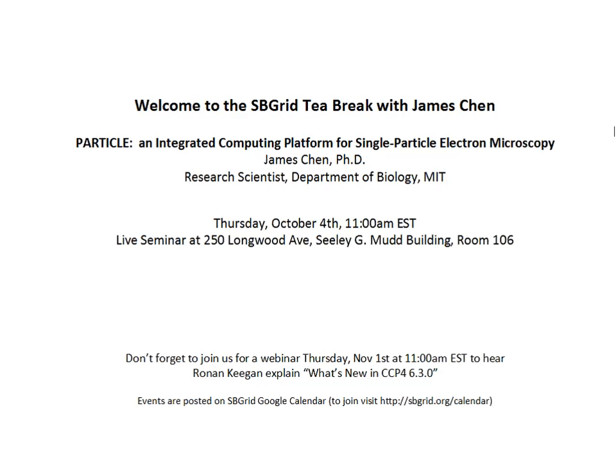Okay. So we've got a number of questions through the seminar. If you guys have any more questions here locally. Just again on how to run it, you said it's been optimized for GPU? Combination of CPU, GPU, yes. But it's hardware dependent. Is it hardware type in mind, or is it fairly generalized? I know it's available for Mac OS, Linux, and Windows. Right. Pretty broad.